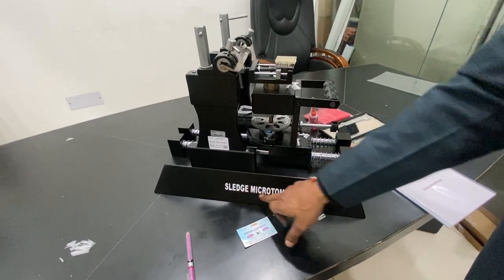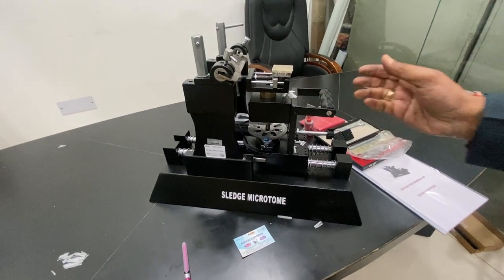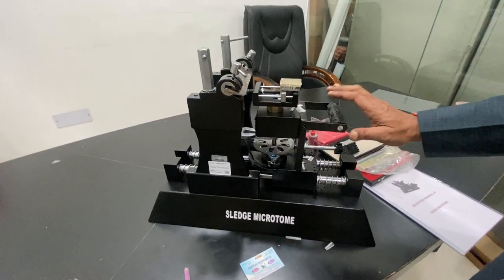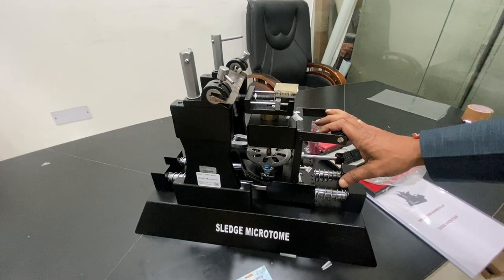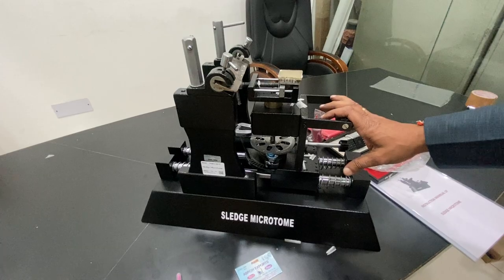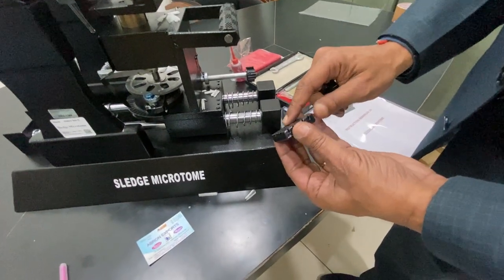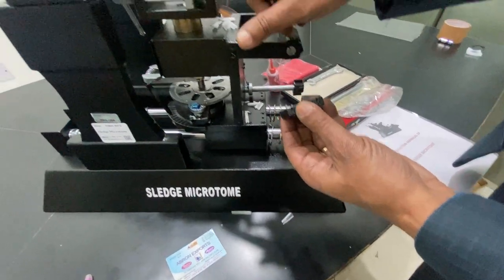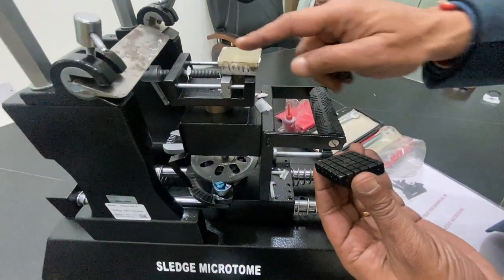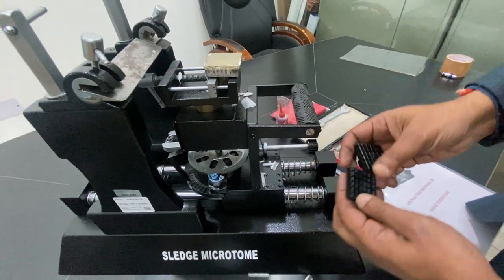This is a sledge microtome, which is for strong bones or harder tissue. It is just a different design; there are also rotary microtomes, precision microtomes, and electric microtomes with us. These are the block holders. We put the blocks and create a block like this, with the tissue sample inside. And these are the two blocks we are providing.